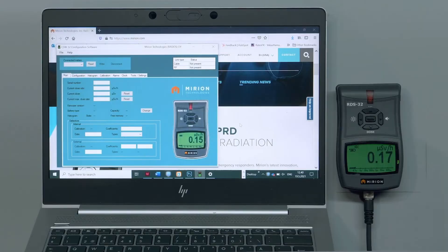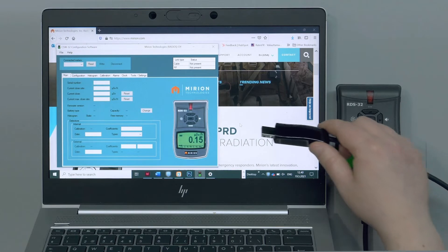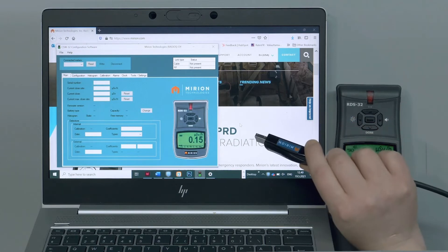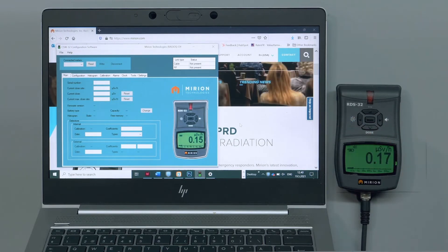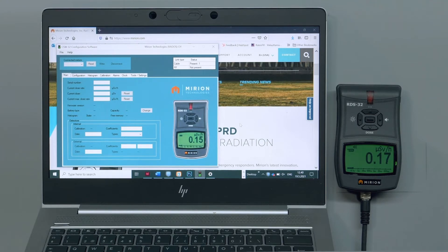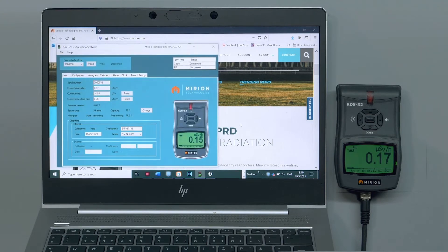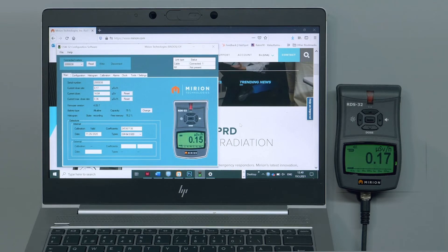The RDS32 also has new CSW32 configuration software and can be connected using the same USB cable link you use with the RDS31. Notice how the meter makes the connection to the CSW32 software automatically.